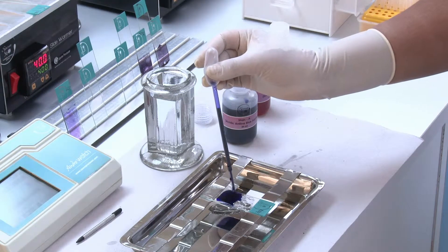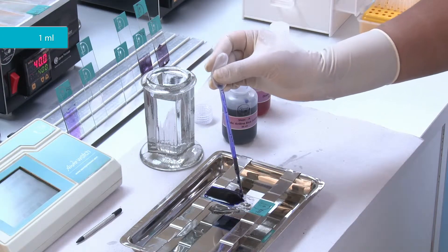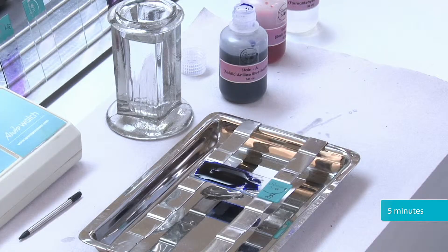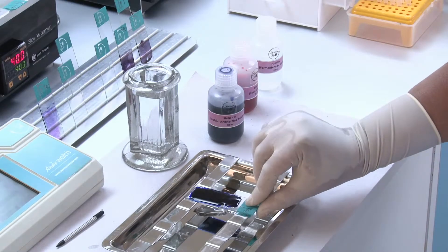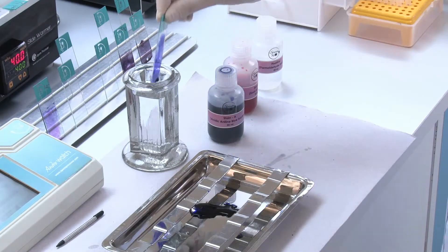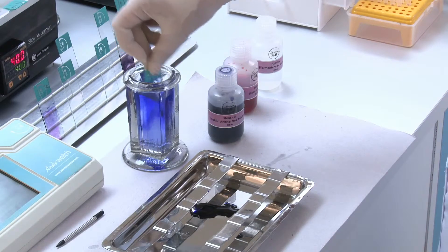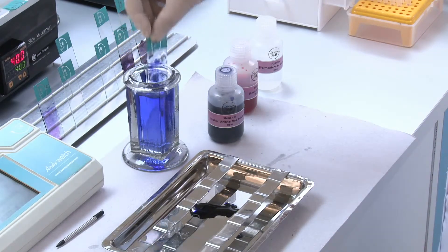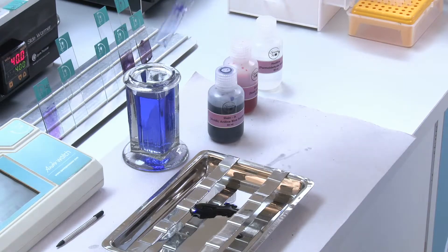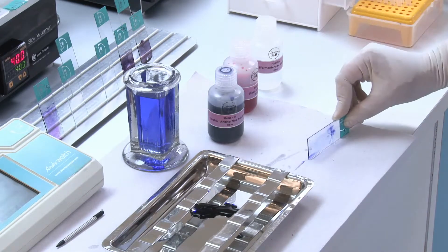Cover the smear with 1 ml of stain A. Keep it for 5 minutes. Drain off the stain A. Rinse the smear with distilled water. Drain off the distilled water.